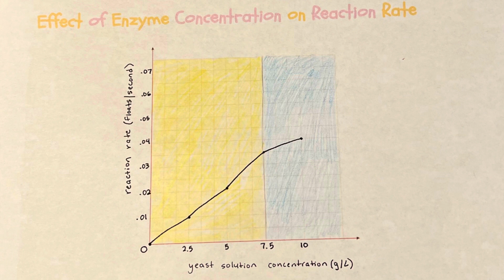In the data, there is a plateau at a certain point on the graph when the concentration is fully saturated or close to fully saturated. This is because increasing the concentration of yeast or increasing the proper proportion of catalase enzymes eventually doesn't matter, since the enzymes have already broken down so much of the hydrogen peroxide into water and oxygen that it won't change the results at a certain point in time. More saturation of enzymes means the proportion of enzymes is greater, which translates into a higher reaction rate, which is shown by the graph.